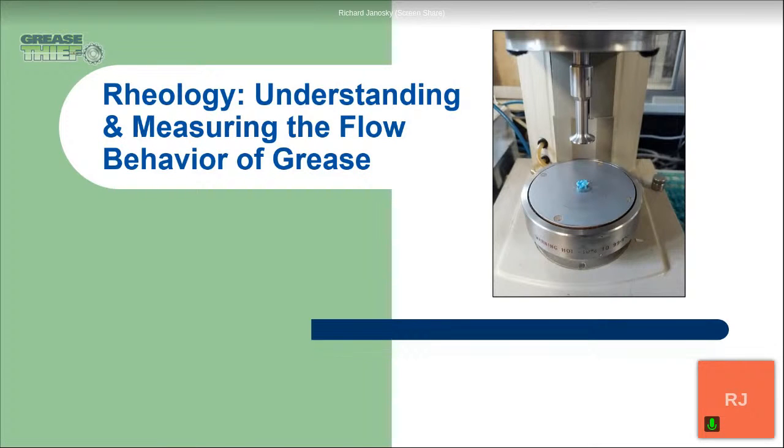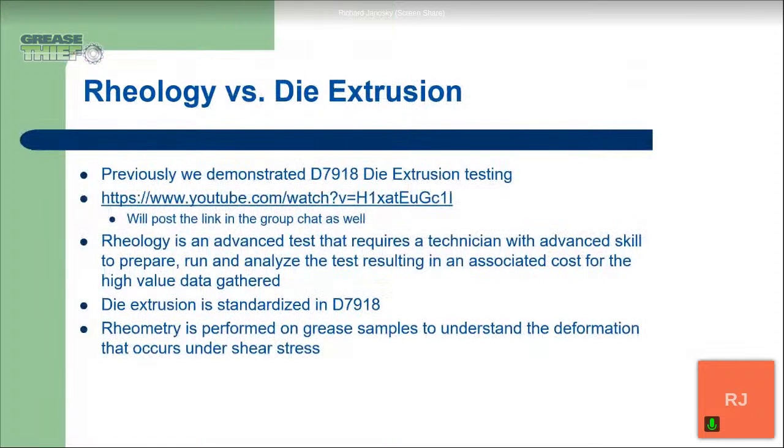Today, we will be talking about rheology, understanding and measuring the flow behavior of grease. So, first, we'll start off talking a little bit about rheology versus die extrusion. In the chat, I will link the video that we previously did on die extrusion. If you have not seen that, you can go back and check that out.